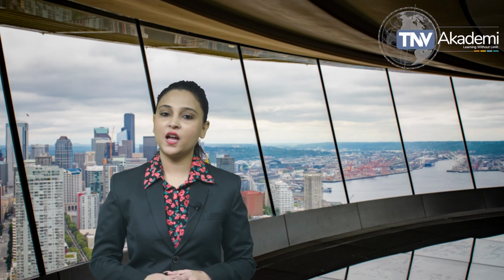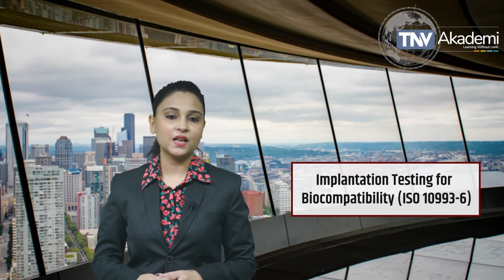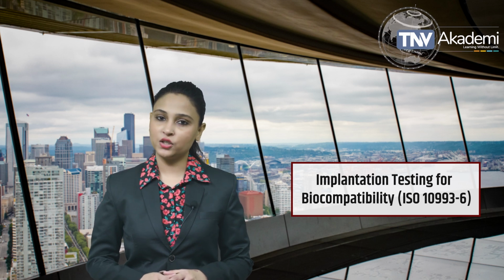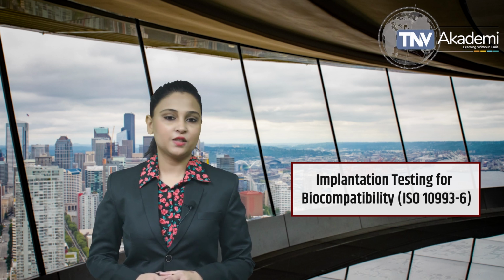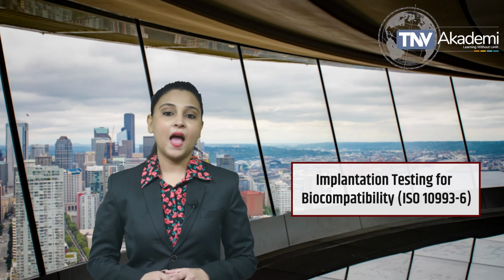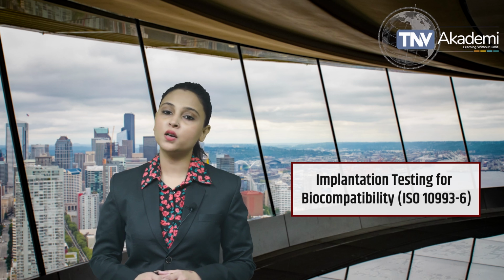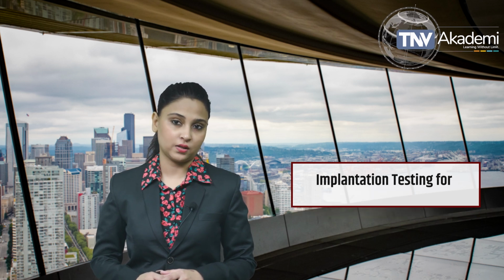My name is Devarshika and today we are going to explore implantation testing as outlined in ISO 10993-6. This part of the ISO 10993 standard is focused on assessing the biocompatibility of medical devices that come into long-term contact with body tissues.